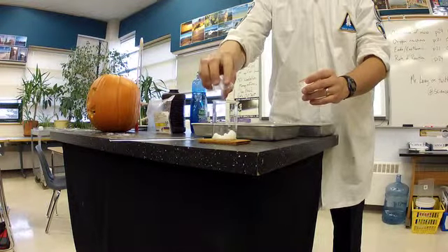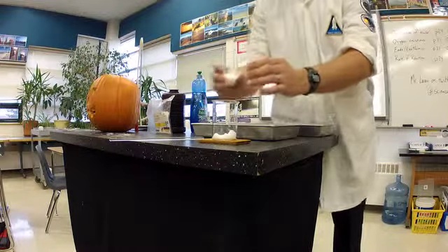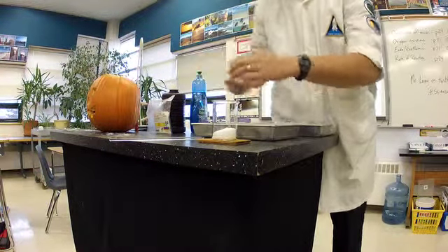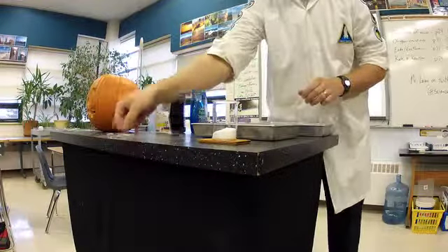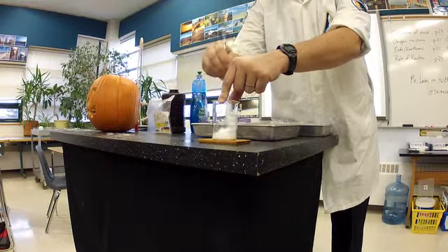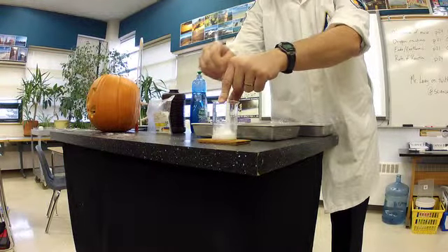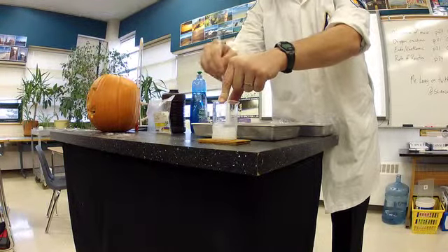Okay? So there's one white substance and then the other and I'll give it a little stir to speed it up a little bit and also observe what you're seeing here. So we have our two powders being mixed together.